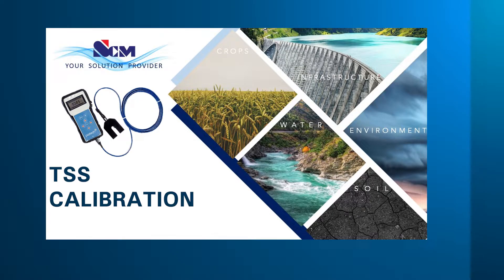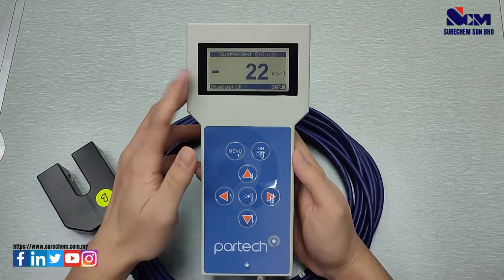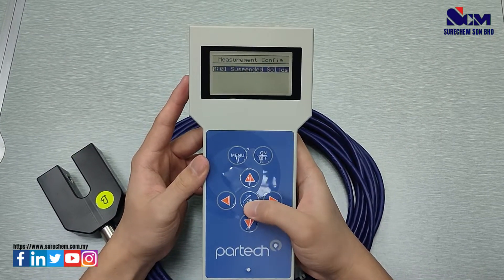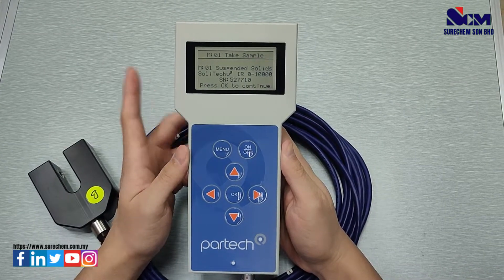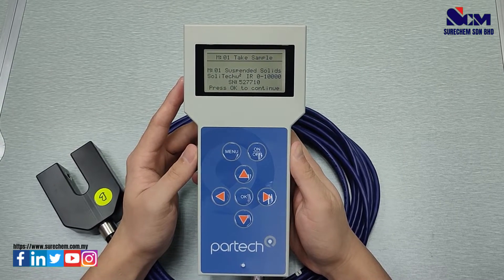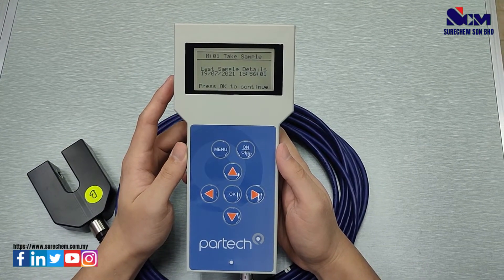Next, how to perform calibration for TSS measurement. Press Menu, go to Sites, select the site — it will show Suspended Solids. Go to Menu, select Measurement Configuration, go to Suspended Solids, and go to Take Sample. Submerge the sensor into the sample, press OK to take the sample measurement. The sample measurement will be saved in the meter alongside the date and time of the sample taken.